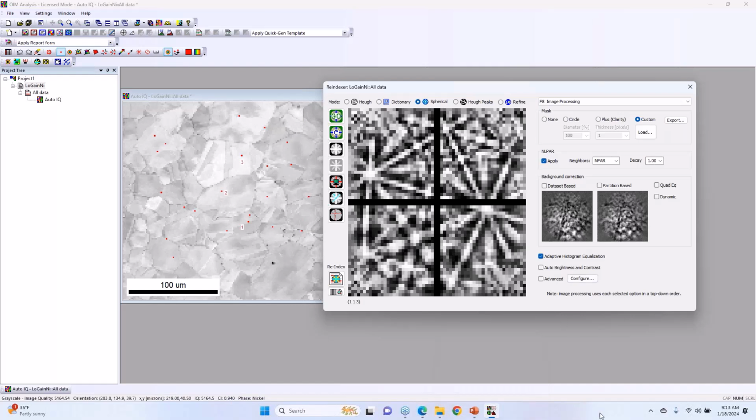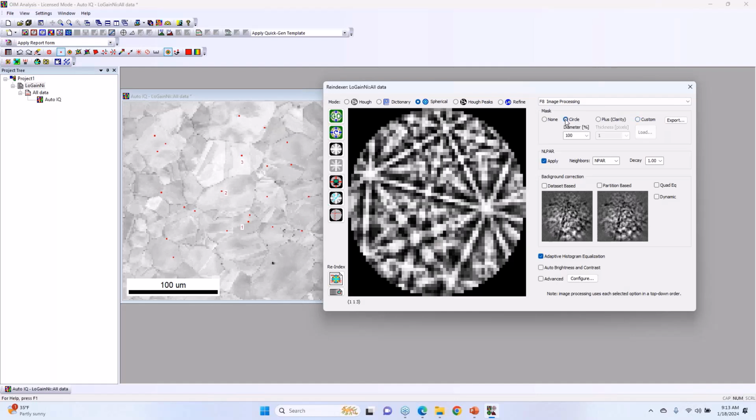So Stephen was asking a question earlier, looking at these topographical samples, how could you mask for those different topographical effects as a way to even improve things further than what I've shown. So I'm going to go ahead and leave this at circle.